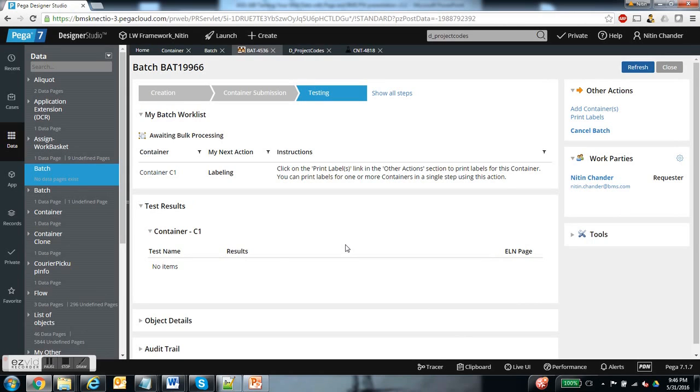But live data cannot just be used for implementing workflow requirements. It is something that can be used for other areas of your application as well. Here's an example of where we are doing exactly that. The UI that you're looking at is a dashboard for a batch. It has a number of sections that configure and display various aspects of that batch that the end user needs to see at a glance. So my work list, for example, provides the actions that the user needs to perform when he's working on this batch. And this is information that is sourced from the cloud data store.